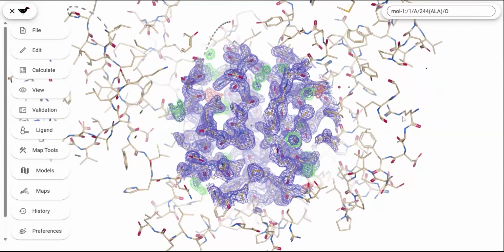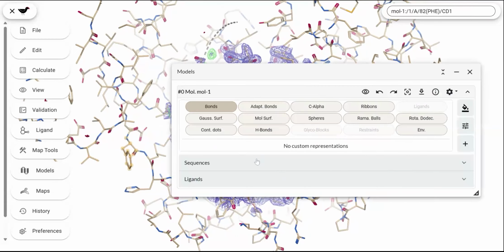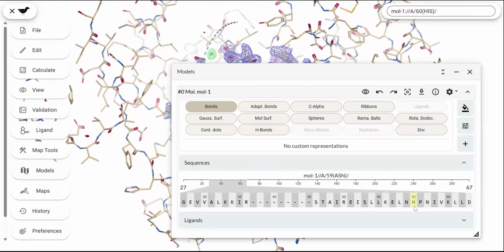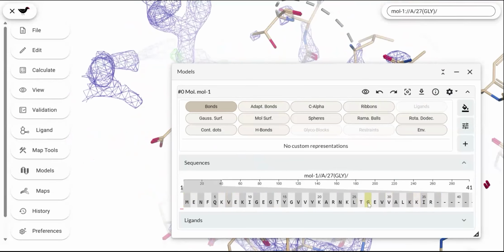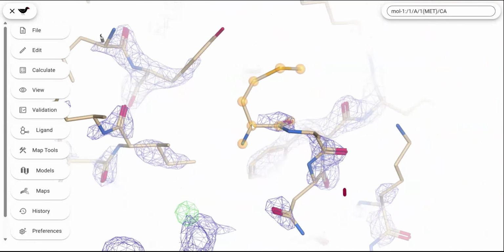Okay, so now that we have this, where exactly does the protein start? We can simply go to sequence and then go all the way to the left and go to methionine. So these are all single letter representatives of different amino acids. There are generally around 20 natural amino acids, and so this is the sequence. We'll just click into here. This is basically the first amino acid. It's also called methionine. And to the right over here in this little area, we see MET, also representing methionine. So we can click on that.